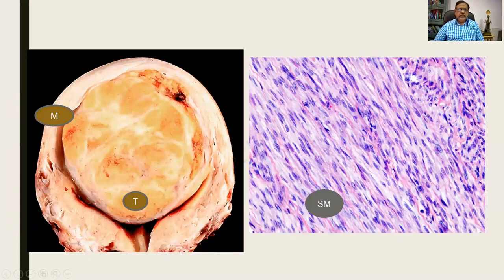Again, a tumor, something like this can be kept for your exam. This is a specimen of a uterus and it measures so many centimeters. The cut surface shows a large tumor projecting into the endometrial cavity. It measures so many centimeters long. It has got multiple trabeculae. The color is somewhat pinkish brown or grayish white, the trabeculae. And this is the normal wall or the myometrium. It is compressed and it measures so many centimeters in thickness. Microscopically, we see the bundles of spindle-shaped cells and this is the cut surface of the same. Sometimes you find that they will be turning on themselves, which is called a whorled pattern.